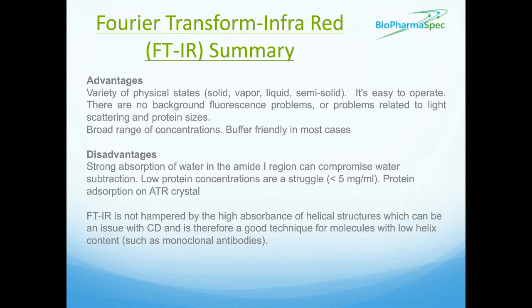However, there are various advances in attenuated total reflection FTIR, which is ATR analysis, and some of the data assessment programs are getting better and better with their predictions. So the minimum concentration that you need is being lowered all the time.